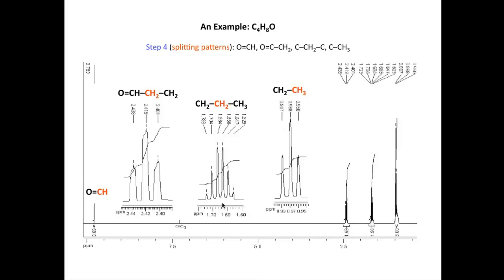This next signal up here, around or near 1.7, contains six lines. And so this is a sextet, and that's consistent with the CH2 being split by five neighbouring hydrogen atoms on adjacent carbons. Namely, this CH2 here and this CH3. So those five neighbouring hydrogen atoms split the signal for this CH2 into six lines.